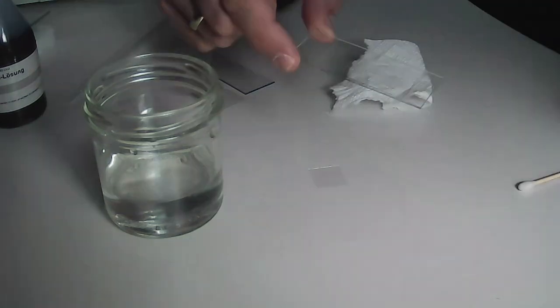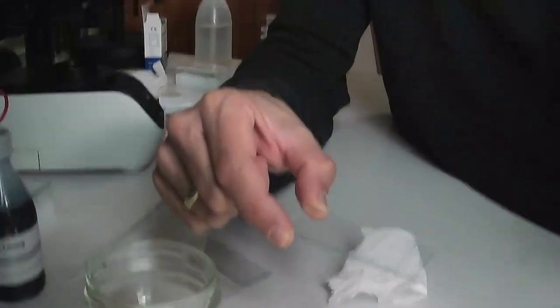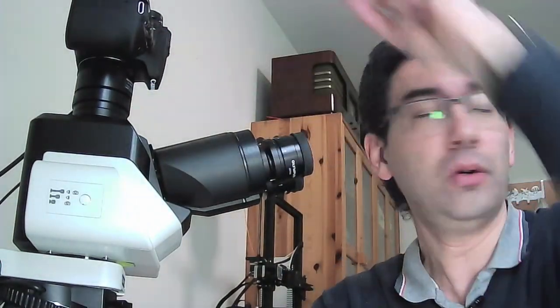So what I'll be doing now is I'm going to switch now over to the camera. The camera is on. And now you should be able to see what I can see under the microscope. So let me turn this on. Does this work? Does this not work? What is this? Okay. So that's the dust and the dirt of the condenser. Let's put this here on here.